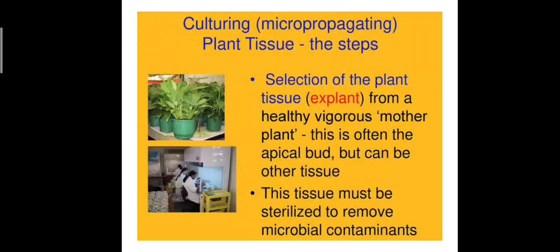The first step is the preparation stage. Here we have to prepare the nutrient medium, select the explant, sterilize the explant, and inoculate the explant.